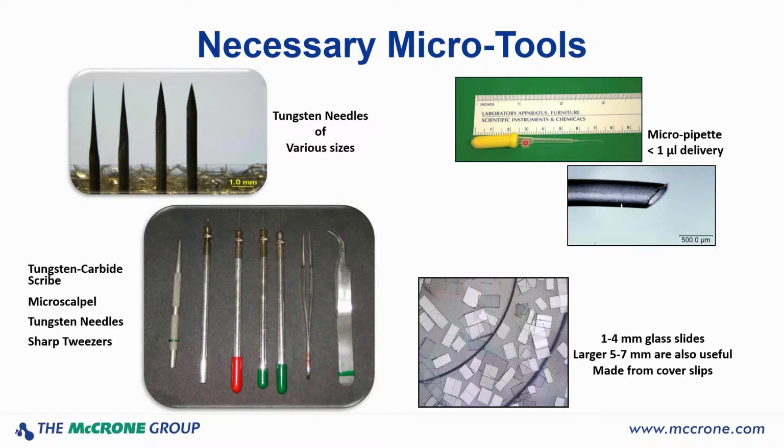You put a hole in this end, and then when the open end is placed in liquid, it draws liquid up by capillary action. When you then touch this tip onto a flat surface, that liquid flows out by capillary action. Again, you'll see me doing that here in a little bit.